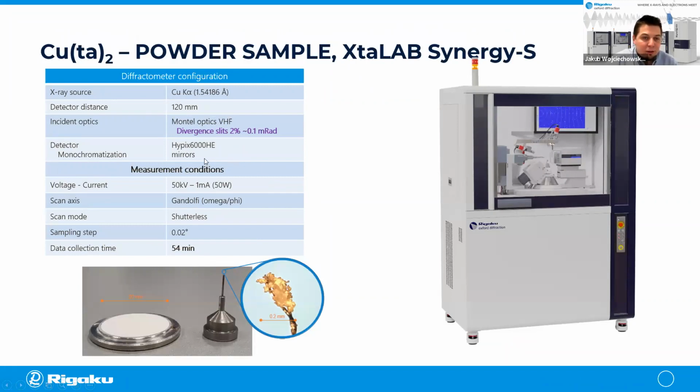Of course, those are single crystal instruments focused mostly on flux and point focus operations. So we have Montel optics with very high flux, but we have what we will talk about later: divergence slits, or divergence control slits.